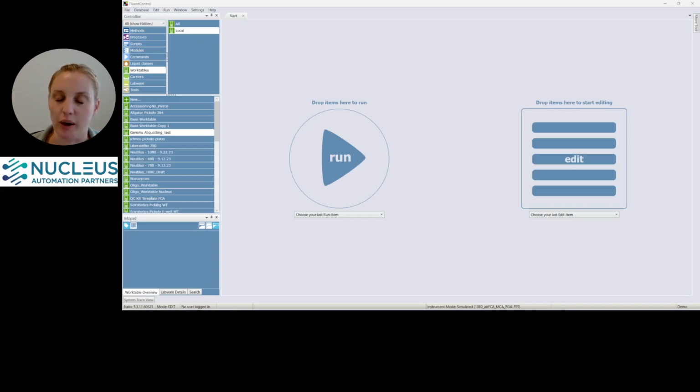In addition, you have to have a Worktable in order to begin scripting. So before we can move on to showing you guys how to script, we have to build a Worktable first. So we'll go ahead and we'll dive right in.